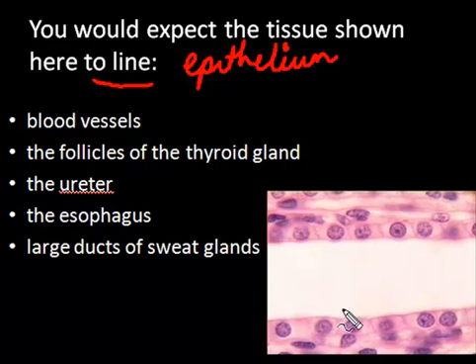And first, of course, you've got to identify the epithelium to then choose which one of these is the right answer. Now, whenever you're looking at epithelium, always identify the basement membrane first. And if you look at this thin line, here is the basement membrane. And this is an image which is taken from one of the sites you were asked to visit. So it's very important that you visit these sites frequently, because the only way you can make out or identify images is constant exposure to these images. So therefore, please look at these images very, very often.